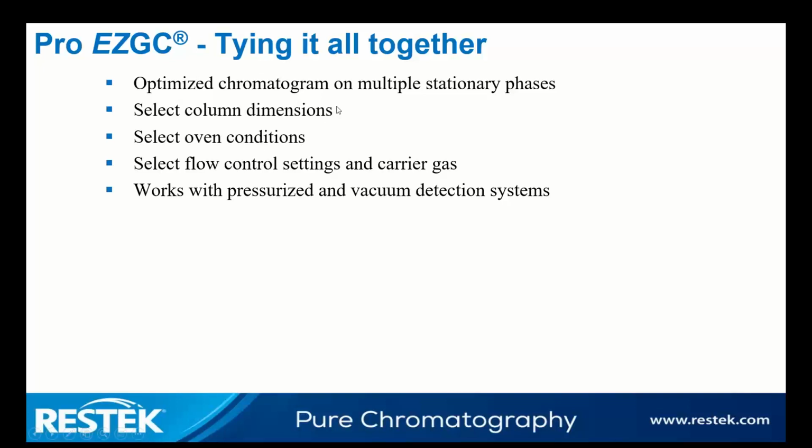Some of those, they may be listed as solvents as opposed to volatiles. That's the only thing. If you're looking at it under option 2, you might look under solvents and you'll find it. And if not, you can just paste it into the box for your option 1, and it will pick all of those different phases you can look at. And that's not even to mention the RTX1, which has a whole variety of different volatiles on it as well.